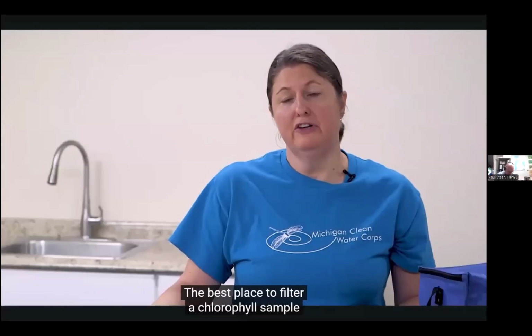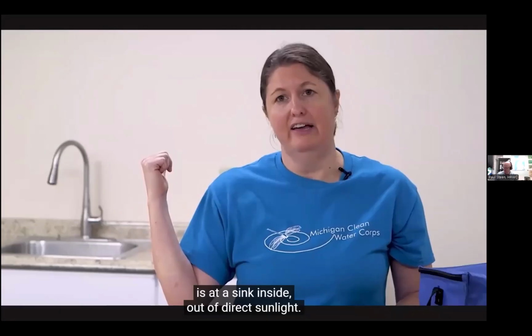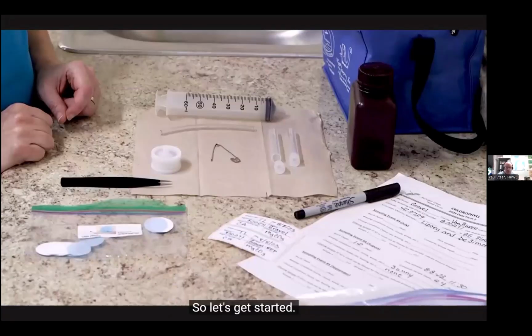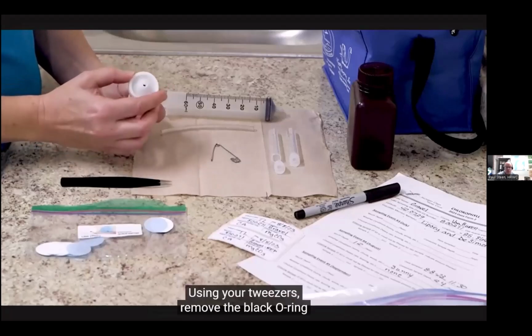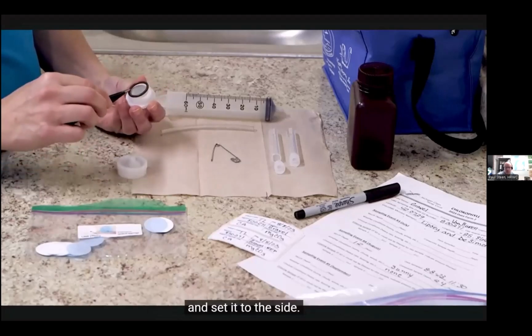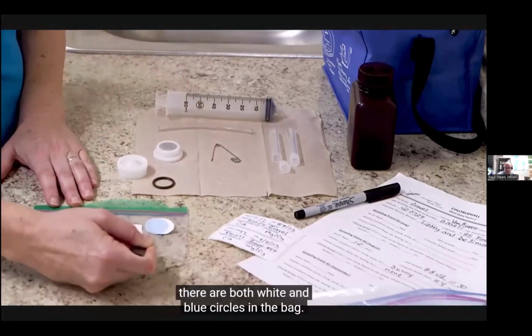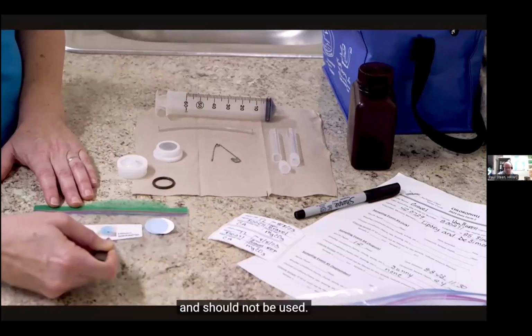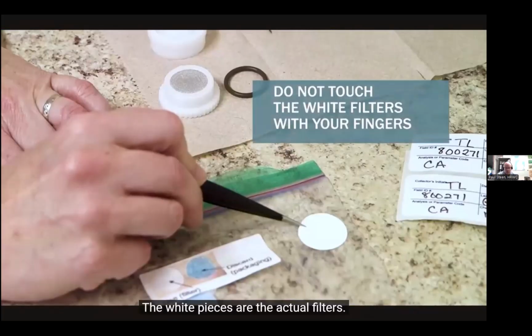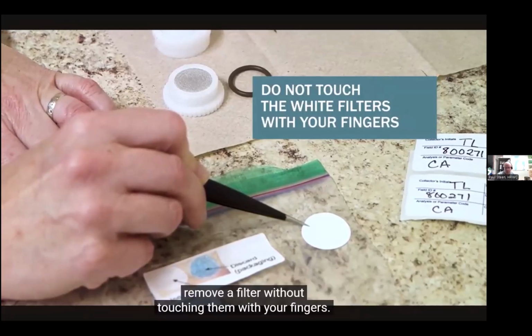The best place to filter a chlorophyll sample is at a sink inside out of direct sunlight. So let's get started. Unscrew and open the filter holder. Using your tweezers, remove the black O-ring and set it to the side. Open the bag of filters and note that there are both white and blue circles in the bag. The blue pieces are the filter separators and should not be used. The white pieces are the actual filters. Using your tweezers, remove a filter without touching them with your fingers.